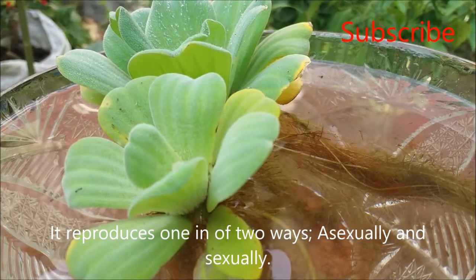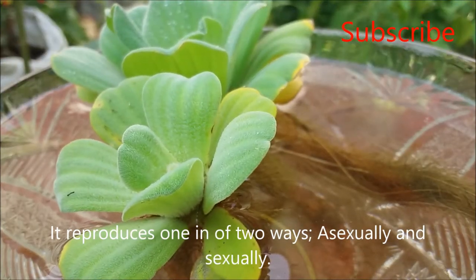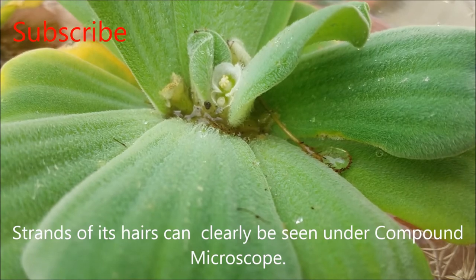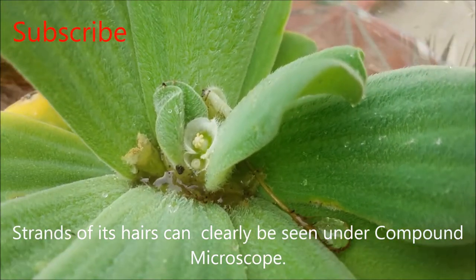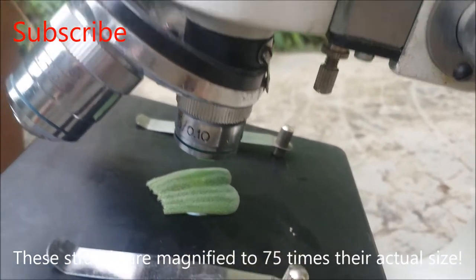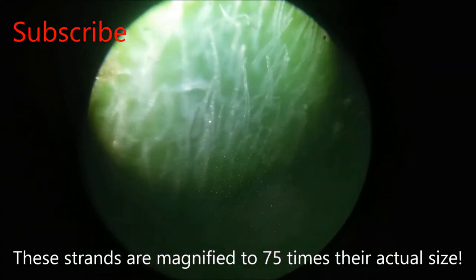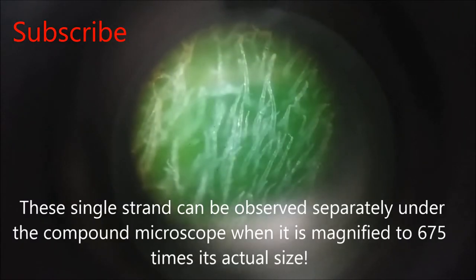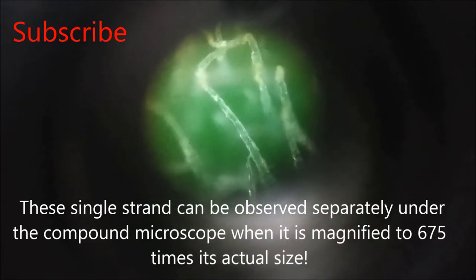It reproduces in one of two ways: asexually and sexually. Strands of its hairs can clearly be seen under a compound microscope, magnified to 75 times their actual size. This single strand can be observed separately under the compound microscope when it is magnified to 675 times its actual size.